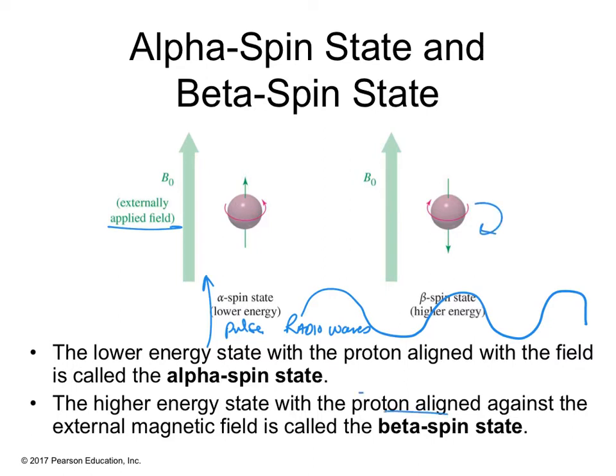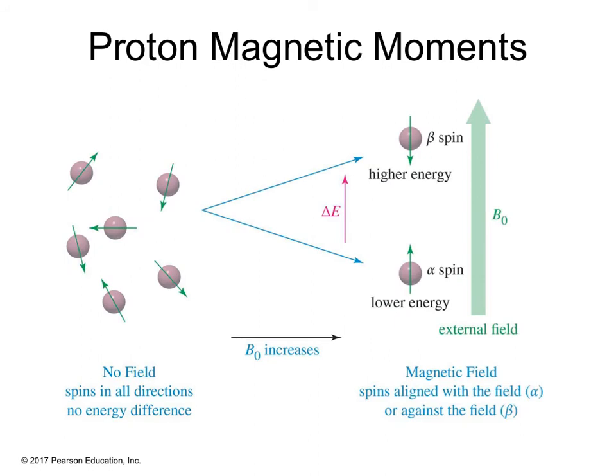Okay, so that's how the whole spin originally gets aligned, and then you take it away, you withdraw the pulse, and then they resonate down to their lower energy. And so that's what's happening here when you pull the pulse away. And then this difference in energy gap can be captured on an NMR spectra.